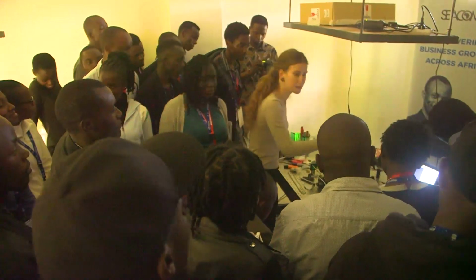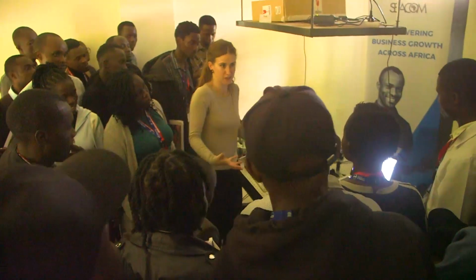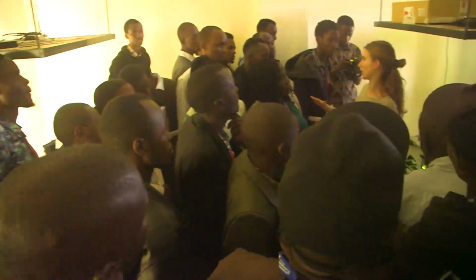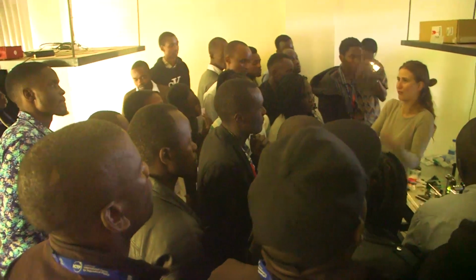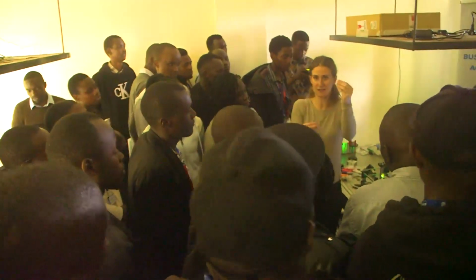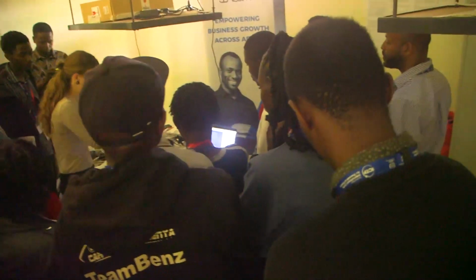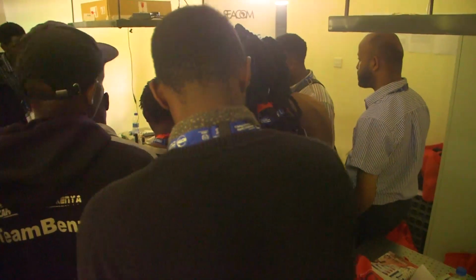So I'm changing the exposure time because it was too bright. If your image is overexposed, you cannot do anything with it, because if everything is white, how can you quantify anything? You cannot say this is larger than that, because everything is at the maximum. So I changed the exposure time a little bit, so we collect for less time.